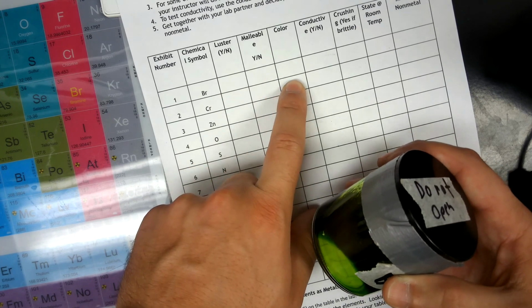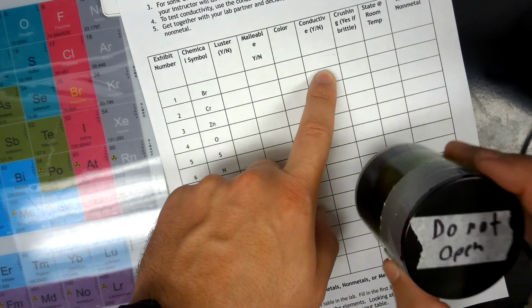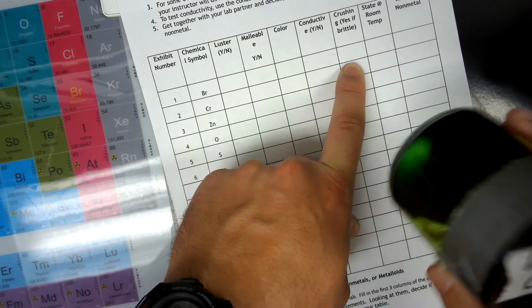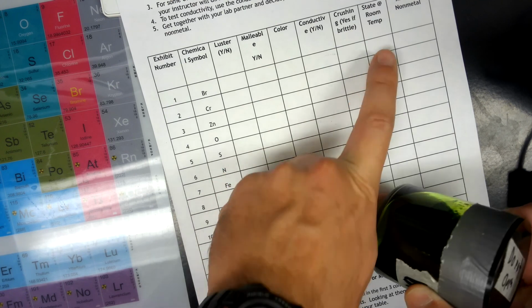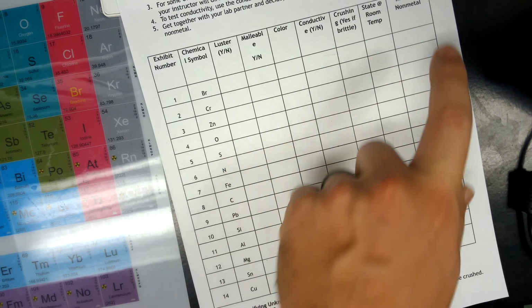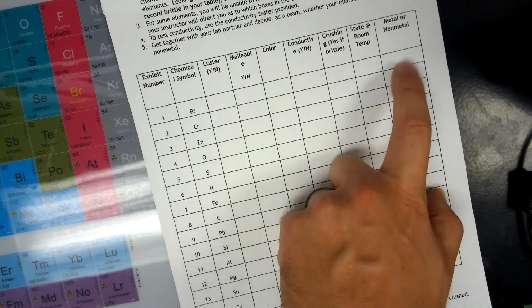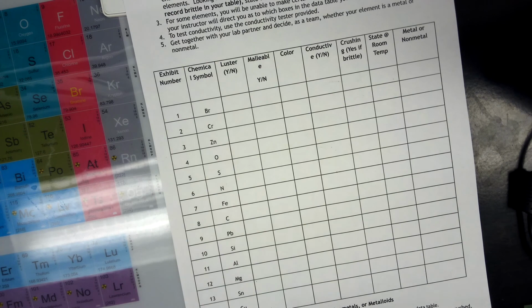It is green. Since it's closed, I would tell you that it's not conductive. We're going to, once again, say it's in its liquid form and cross that one out for crushing for bromine, because it's a liquid. And then I'll leave it up to you to use ptable.com to find out if this is a metal or a non-metal by looking at your periodic table online.